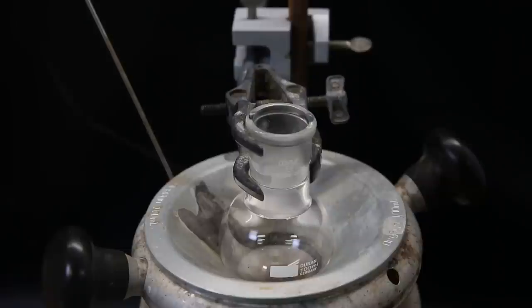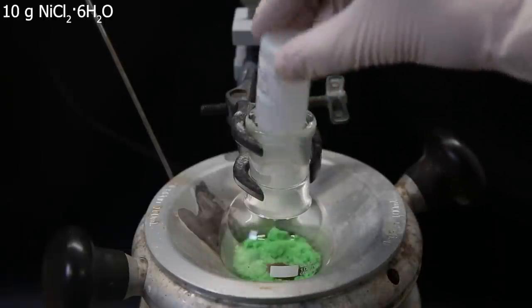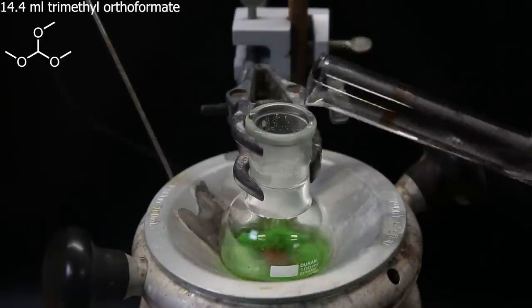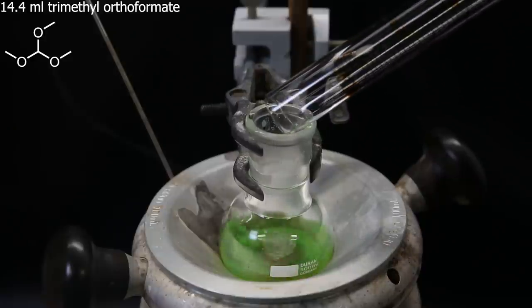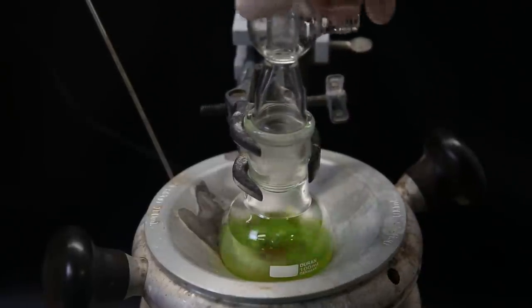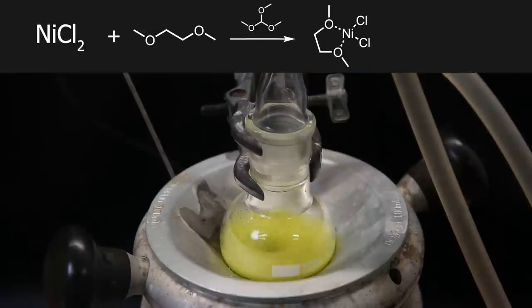So I set up a flask in a heating mantle and add in a stir bar. I then add in 10 grams of nickel(II) chloride hexahydrate. On top of that, I add 30 ml of 1,2-dimethoxyethane and 14.4 ml of trimethyl orthoformate. I then attach a condenser and heat it to a reflux. The mixture quickly turns yellow, which is because of the formation of the product, nickel(II) chloride DME, which precipitates out of solution. In this reaction, nickel(II) chloride and 1,2-dimethoxyethane can complex with the help of trimethyl orthoformate to form the nickel(II) chloride dimethoxyethane complex, or nickel(II) chloride DME for short.